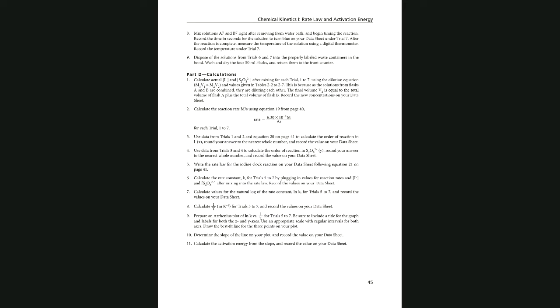Part D of the experiment, it's not actually experiment, but it tells you in detail how to find the concentration first for the reactant 1 or reactant 2. Remember, flask 1 and flask 2, when you're adding together, the total volume is going to be count for the V2. So if we have the V1 and we have the M1, the V2 is the total volume, not just the flask 1. So the total volume, the way this experiment is designed, when you add A1 and A2, the total volume is going to be 19. It's not going to be 8, it's not going to be 11, it's going to be 19 because you are mixing the 2 flasks together.